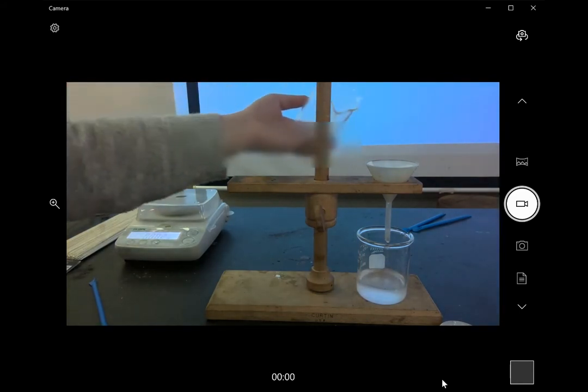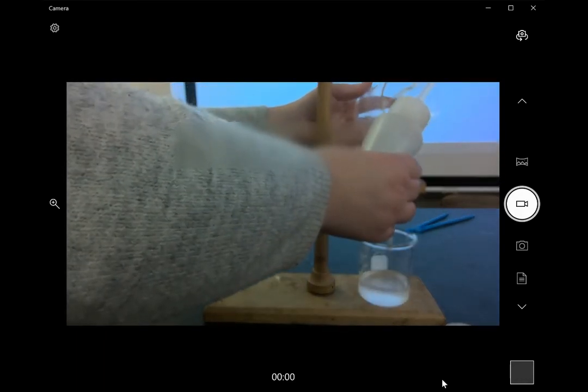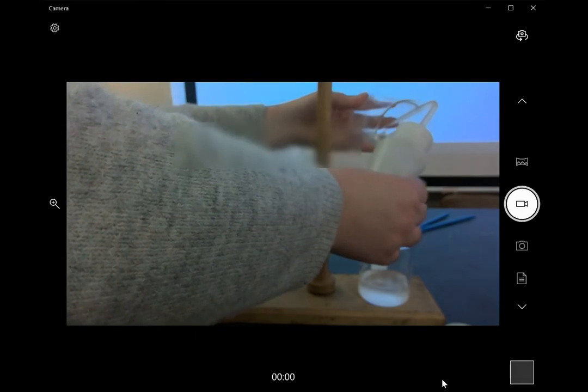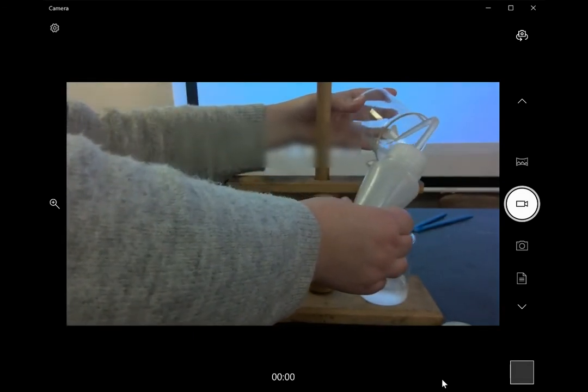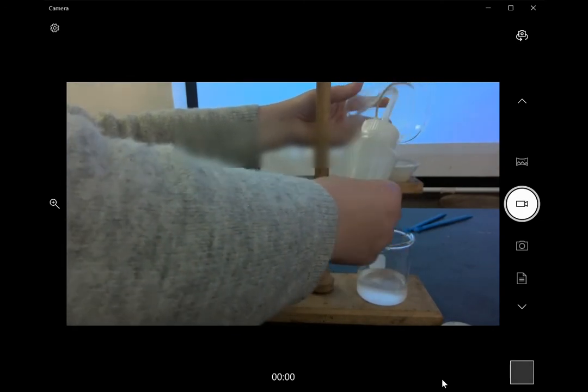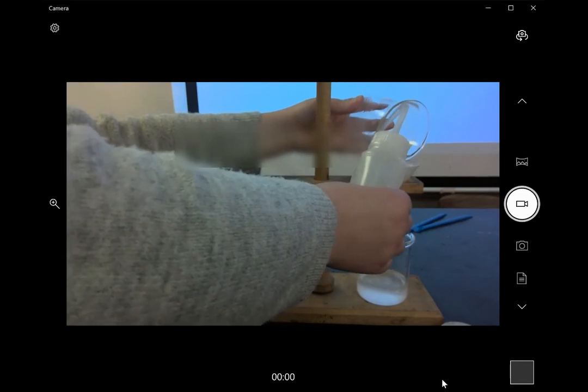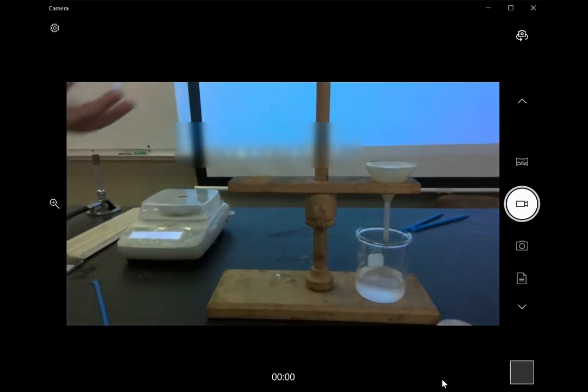So once we've emptied our beaker, we want to make sure to wash it out. We can see that there's still some product left in it, so we're going to use distilled water and rinse it out so that all that product that we produce, or at least as much as possible, ends up in our filter paper. Any that remains on the sides of our beaker, we want to make sure we put in our funnel.